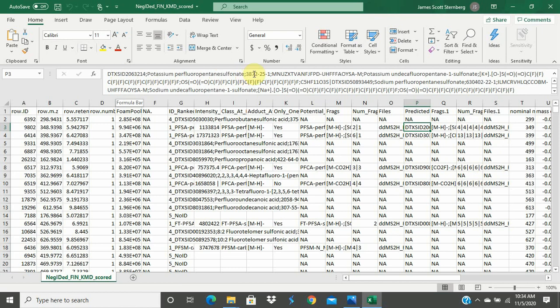Next, you'll find other identifiers to help look up the compounds, such as the CAS registration number, the INCHI key, the IUPAC name, and this is a SMILES structure contained in the EPA master list. And then you'll see the canonical MS Ready SMILES. This is the one you'll want to use when looking for the structure. And last, you'll find the molecular formula for non-adduct.